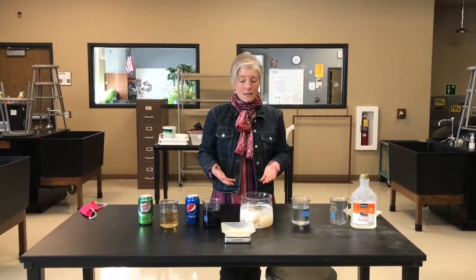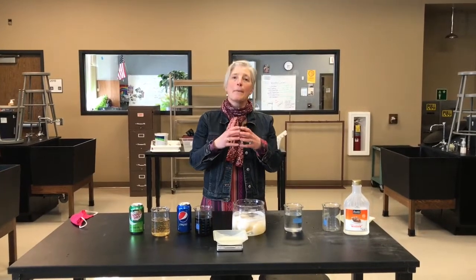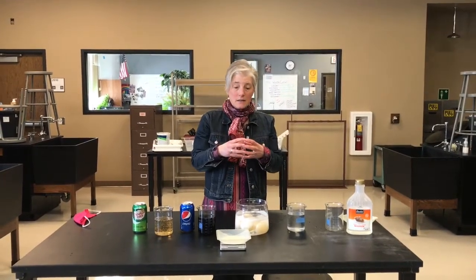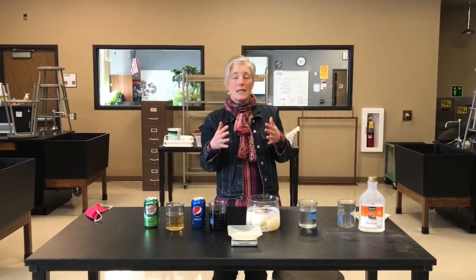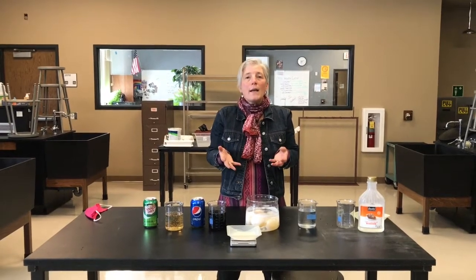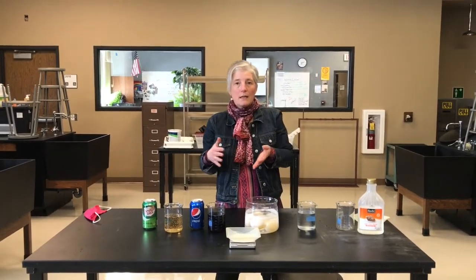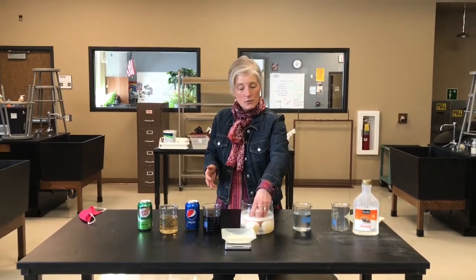Well, today, this lab that we're showing you is going to act like that's a cell membrane. If the egg is a cell, that's the cell membrane. And as you remember, cell membranes control what goes in and out of a cell. So this lab is going to look at what is allowed to move in or out of the cell. We're going to use the egg to do that.